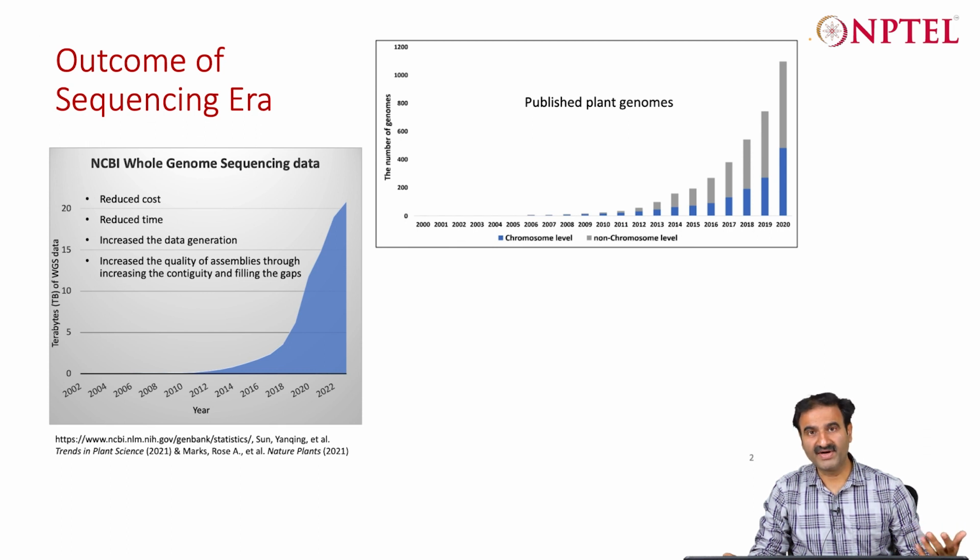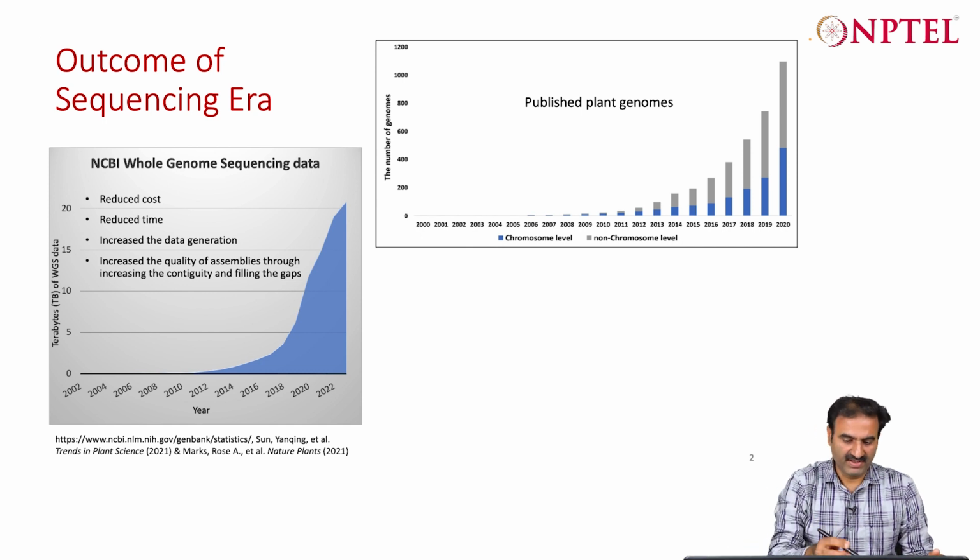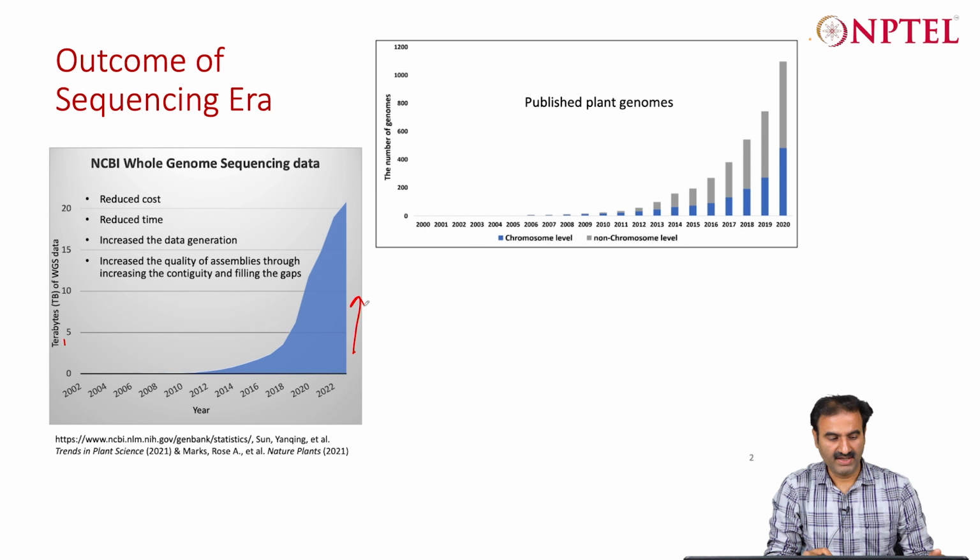What has happened recently is that the cost of sequencing is decreasing hugely, and the amount of data generated by these methods is increasing every day, in terabytes.